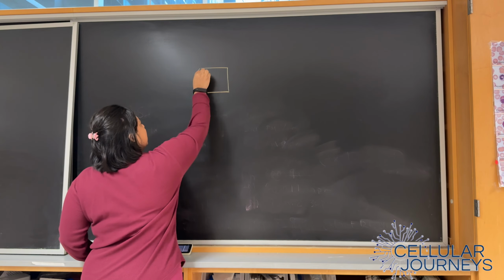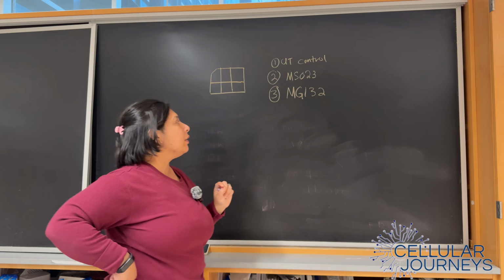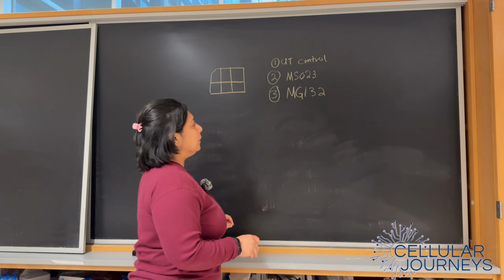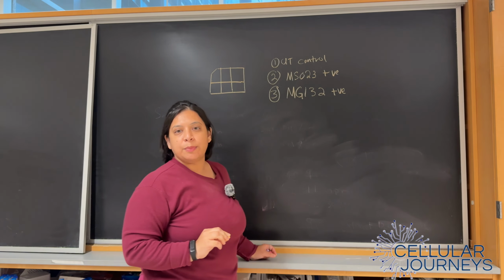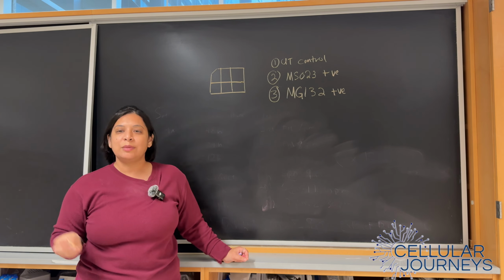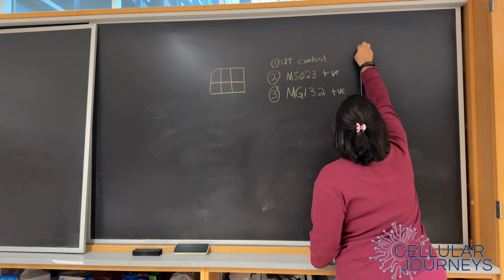One for making sure that we know what it looks like when PRMTs are inhibited with a general PRMT inhibitor, MS023. And then a second where we know what protein expression will look like when we activate the apoptosis or autophagy pathway by using a proteasome inhibitor, MG132. So those are 2 different ways that we're going to be examining for protein expression that happens in our suspected pathways, and then we'll compare it to our experimental system, which is with our own drug.